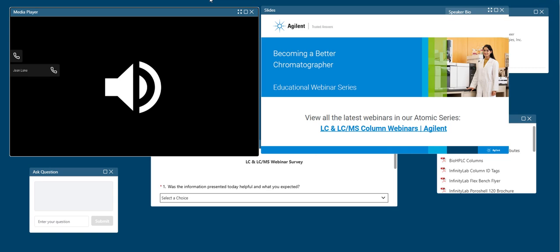There'll be an area where that initial slope is going to change due to the slope of the individual pore column kicking in. So it's usually at the area where it's the exclusion limit of the individual pore column. If your sample is eluting in and around that area, you potentially could see some false information, like shouldering or a bimodal look to your sample. So if you can avoid doing that, I would avoid doing that.